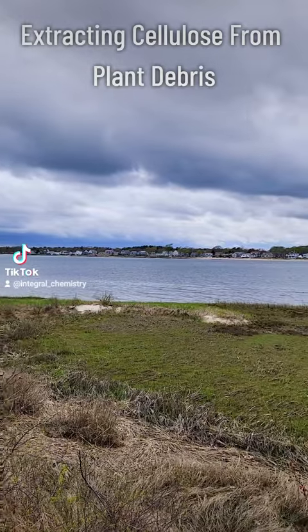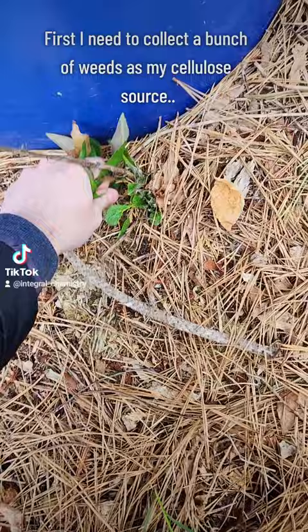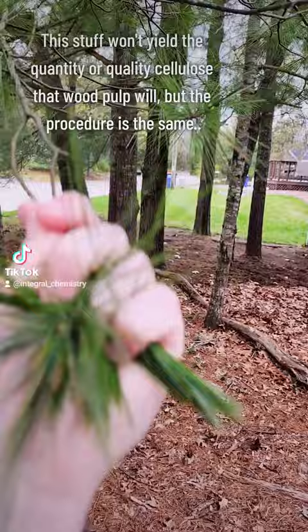It's finally spring in New England, which means I finally have access to the outdoors to do science. The first thing you'll typically notice about spring are the plants, and plant cells, unlike animal cells, have cell walls which are composed primarily of cellulose. To that end, I decided to make a video on extracting cellulose from whatever plant material I could find in my yard.